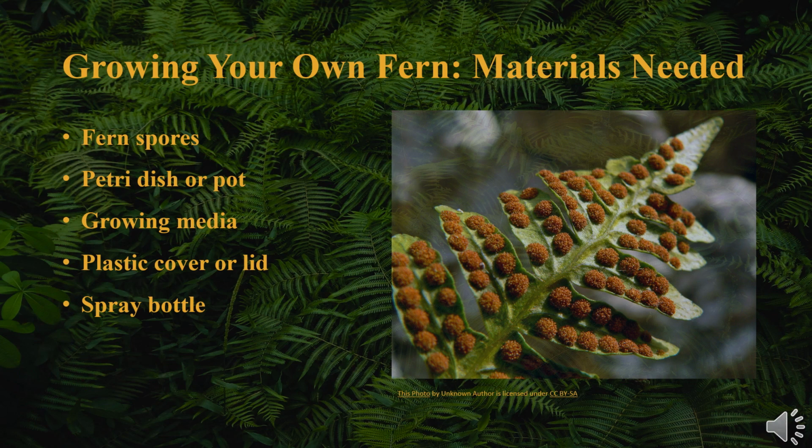Materials needed. Number 1, fern spores. Number 2, a petri dish or a pot. Number 3, growing media, agar for petri dish or soil mix for a pot. Number 4, plastic cover or a lid. Number 5, spray bottle.